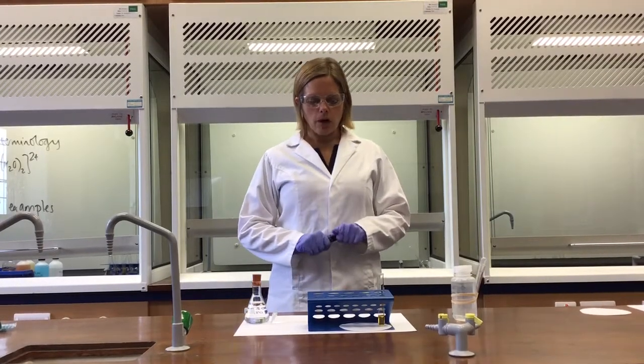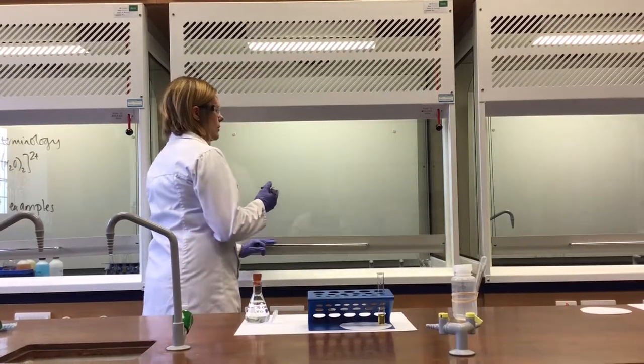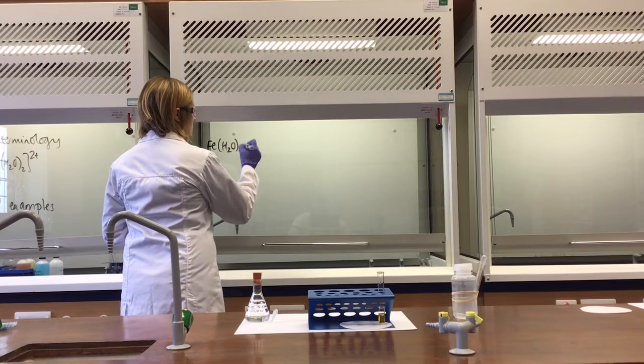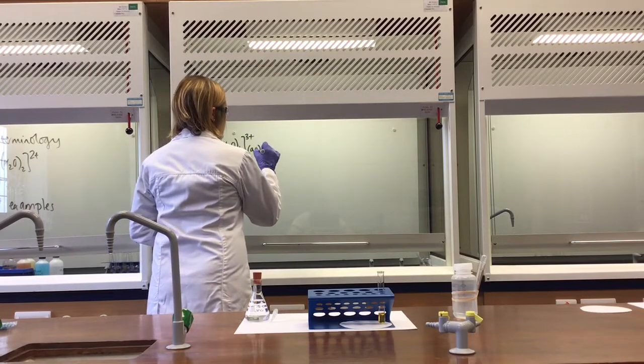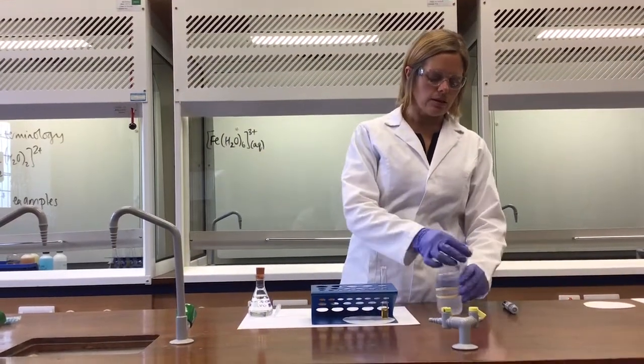So I've been having a look at different complex ions, and in this test tube here I've got some iron 3 aqueous ions, so that's Fe(H2O)6 3+. Now, one example of a ligand substitution reaction with a fairly dramatic colour change is this one.